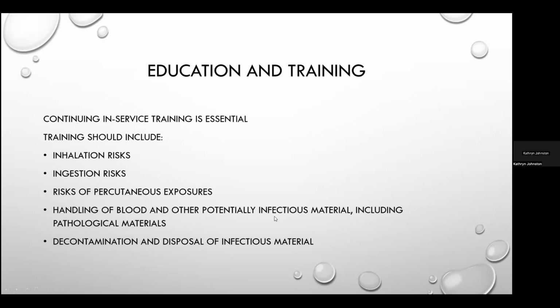Continuing in-service education and training is essential, and training should include inhalation risks, and that is aerosol production when using loops, streaking agar plates, pipetting, making smears, opening cultures, taking blood serum specimens, etc. And then ingestion risks, there should be training about that when handling specimens, smears, and cultures.